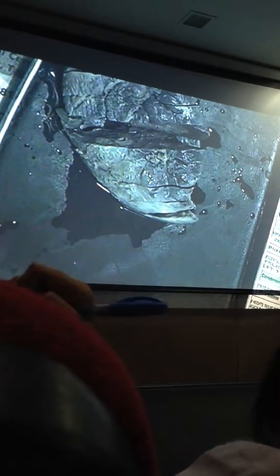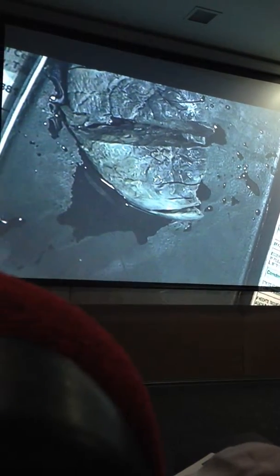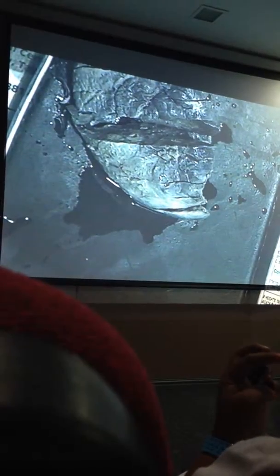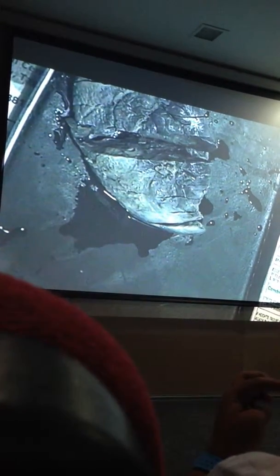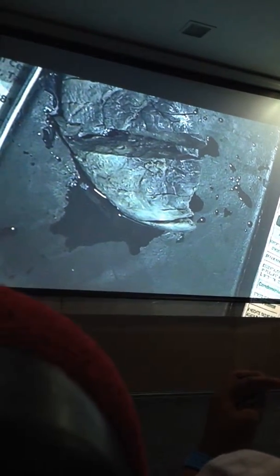Okay. So those are areas of caseous necrosis, and the entire thing that you saw under microscopy, although we haven't touched on inflammation, you'll get to know that slide again or see that slide again on TB come next week. No, the entire thing there is your granuloma, those ovoid lesions. The central area is the area of caseous necrosis, the acellular area.